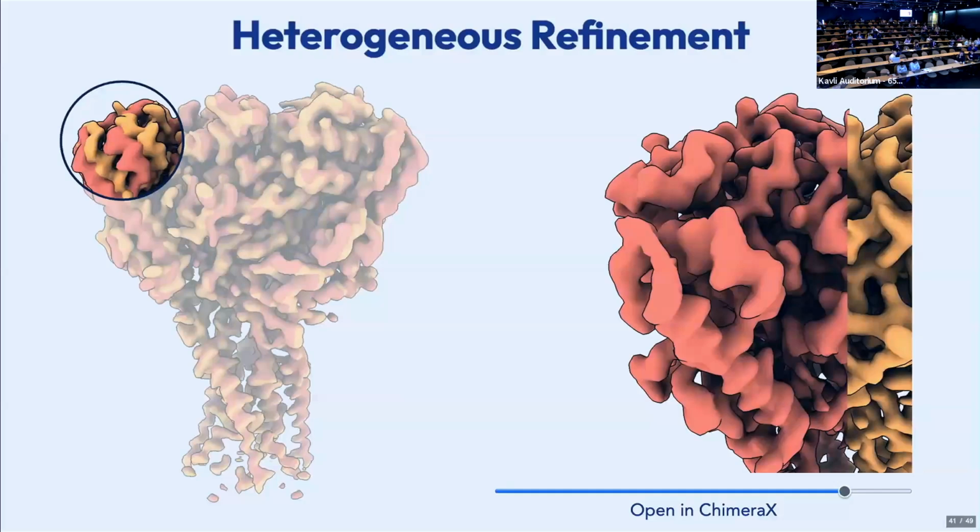Heterogeneity is a case where the opposite can sometimes be true. Not to say that you should ever collect poor quality data, but if you imagine even a data set like this, which, in terms of the heterogeneity that people see in real life, you could even call simple compared to how many states or how many classes some proteins have, some systems, whatever you're trying to study.